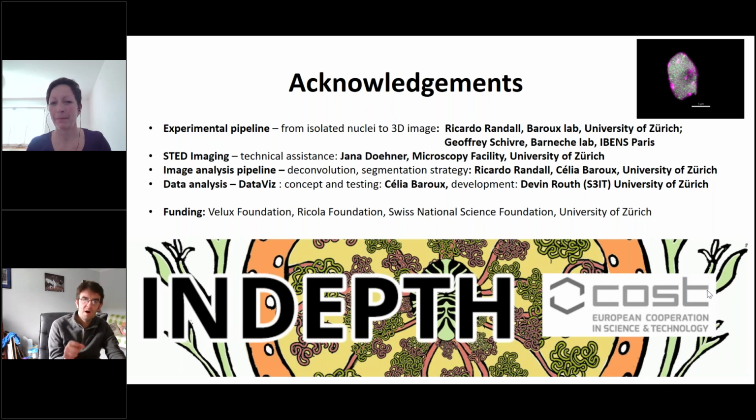So let me ask, are you working with IMARIS at all on the DataViz? Are you collaborating with them on that as well? No, we don't collaborate with the IMARIS people. We use IMARIS for the image processing. That's the first step after we have the image, and we do it ourselves. We have a license from the University of Zurich. So we don't collaborate with IMARIS, but I might approach them to tell them we developed a tool that could be useful for them, and if they want to improve it, they could perhaps support us.